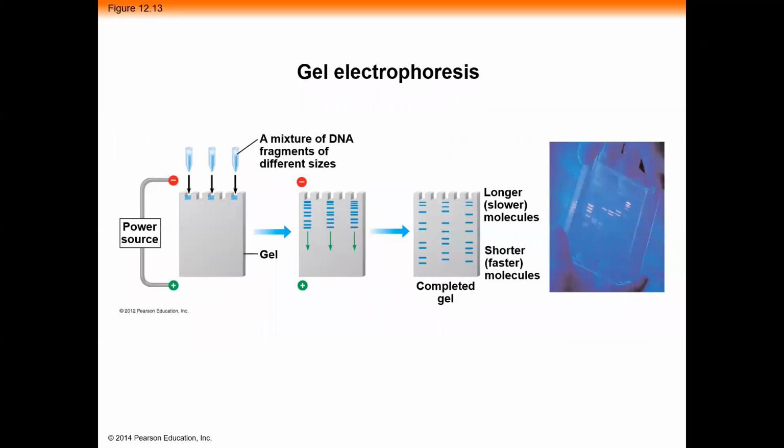So going back just quickly to gel electrophoresis, again, you have a mixture of different fragments and different sizes of the DNA. You put it in some electrical charge, and then after some time, you will see these bands start to form. And that's essentially what you're going to be doing. You're going to be taking M&Ms, I believe, and taking the dye off of the M&M, and loading that into your little gel electrophoresis and seeing the separation of those dyes in your little electrophoresis chamber.